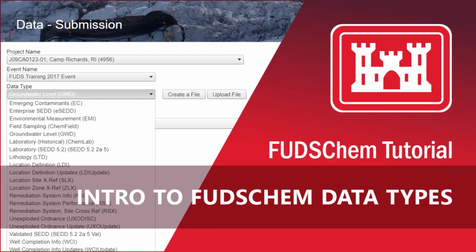This video will go over the types of data that are entered into FUDSChem. FUDSChem has the capacity to store chemical, geological, and hydrogeological data. The system can be used to plan sampling events, track projects, validate analytical data, generate final reports, perform data usability assessments, and view data in spatial systems. Each of these functions has different data types associated with them. Note that your district will determine the exact requirements for your project.